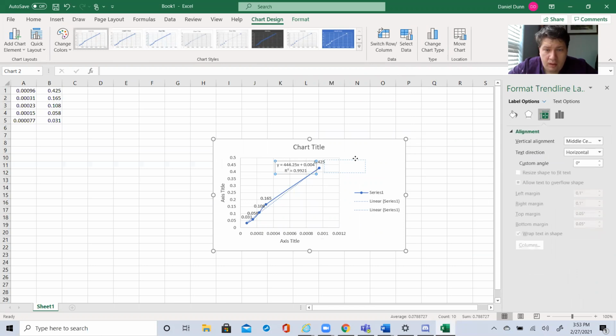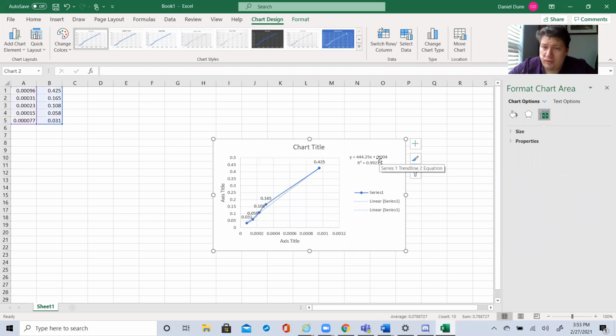Now, I'm not going to show you how to label your graph. You should do it yourself, but it should be calibration curve of iron thiocyanate. This over here should be absorbance, and then here should be concentration. Here is what my graph looks like. Now, your numbers will look a bit different, but this is pretty close to what you should be getting. So, this is the entire reason why we did the first part of the lab, is this right here. So this right here is part A. Part A is done. So let's look at how to do part B.